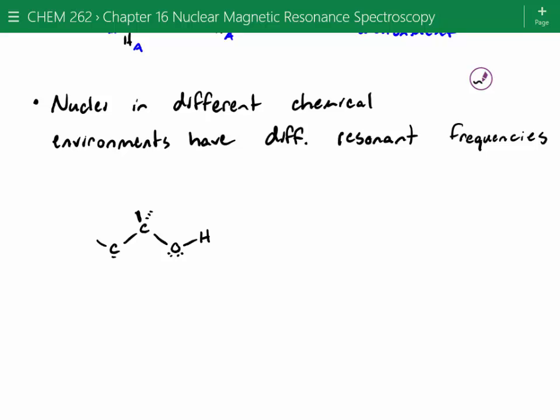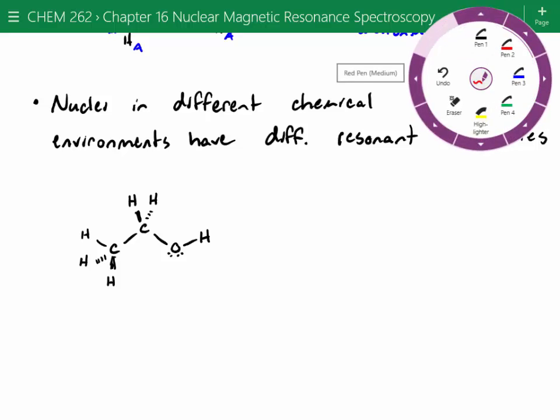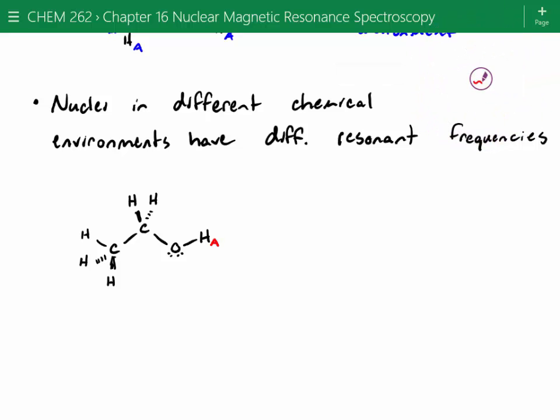All right, so we've got a bunch of protons coming off of here. And if we think about this, we've got the terminal methyl group, and then we've got the methylene protons in between. How many unique sets of protons are on this molecule? Let's work our way right to left and ask ourselves: if we're looking at this proton over here, HA, are there any other protons on the molecule just like it? No, so it'll have its own signal. There are no other protons in the molecule just like the proton that I've labeled as HA, so it will only have one signal.